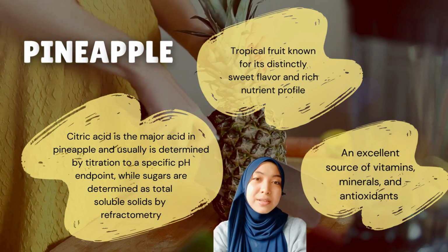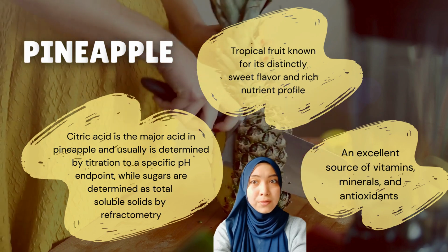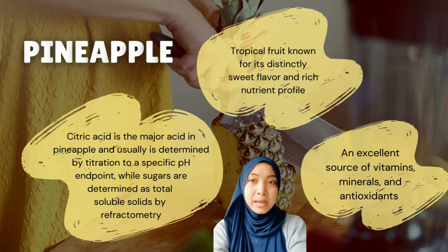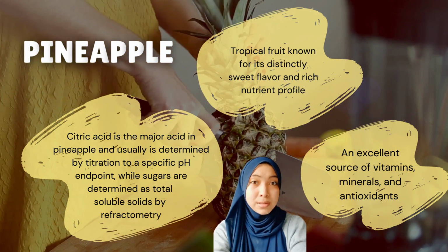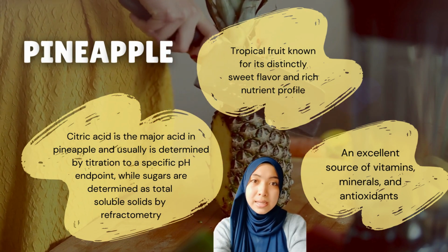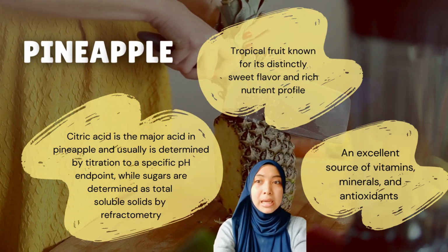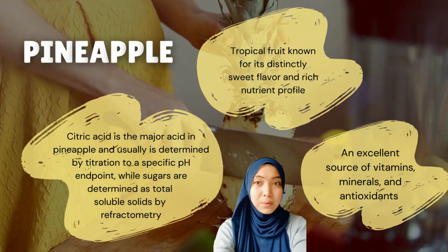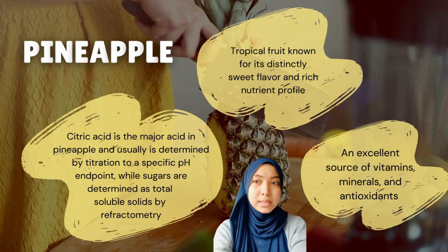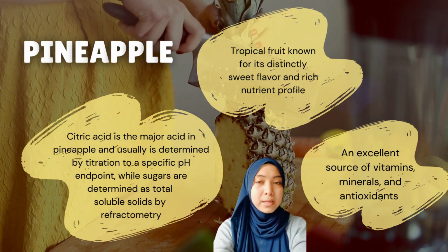First of all, let me introduce pineapple. Pineapple is a tropical fruit known for its distinctly sweet flavor and rich nutrient profile. It is also an excellent source of vitamins, minerals, and antioxidants. Citric acid is the major acid in pineapple and is usually determined by titration to a specific pH endpoint, while sugars are determined as total soluble solids by refractometry.